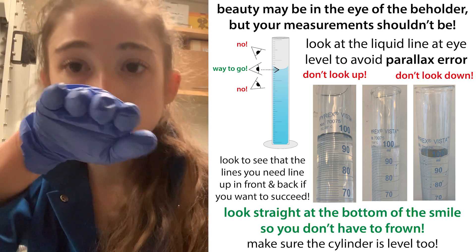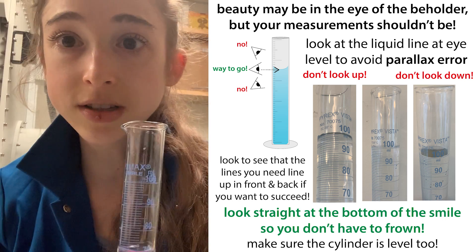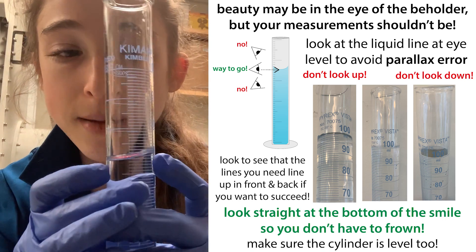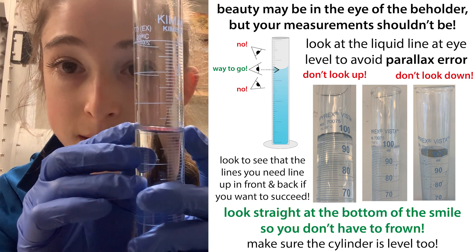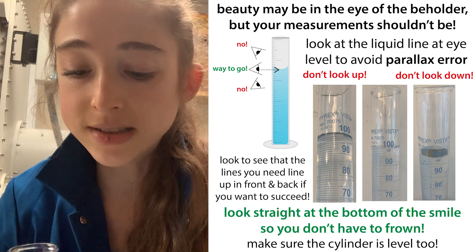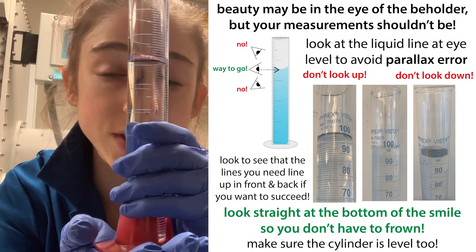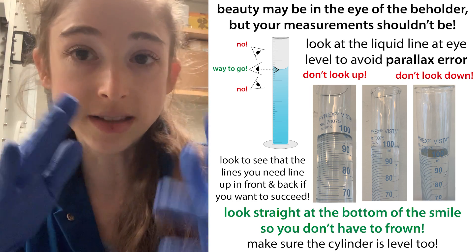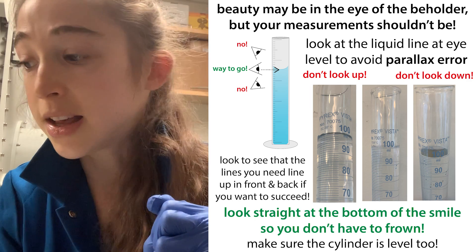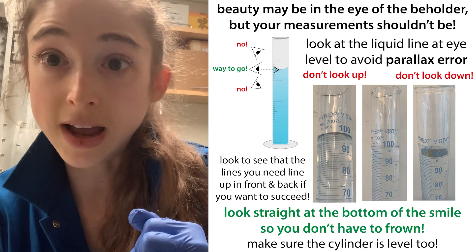Remember to keep it level and keep your eyes level with it. Use something light or dark behind it depending on what helps. Look and see that the lines go around and line up with one another to make sure it's level—both on a flat surface and with your line of sight. That's just some tips for how you can make your measurements matter. Happy measuring!